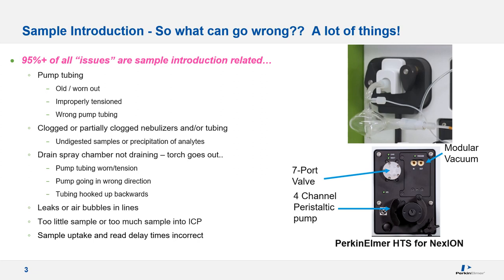Other common issues are having leaks or air bubbles in the lines that cause signal instability and spiking, delivering too much or too little sample to the plasma, or having your sample uptake and re-delay time set incorrectly so you start acquiring data before the sample is even in the plasma or before the signal is stabilized. Most of us don't even notice we have a problem until a QC check sample in an analysis fails. The key is to always start troubleshooting at the sample introduction system.